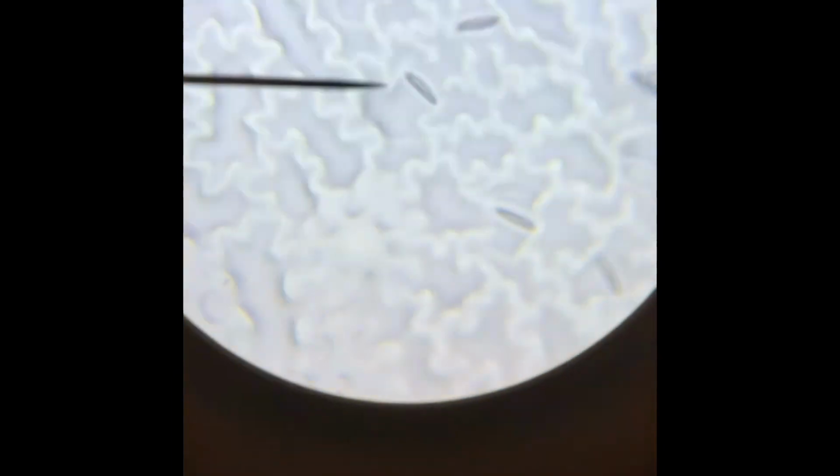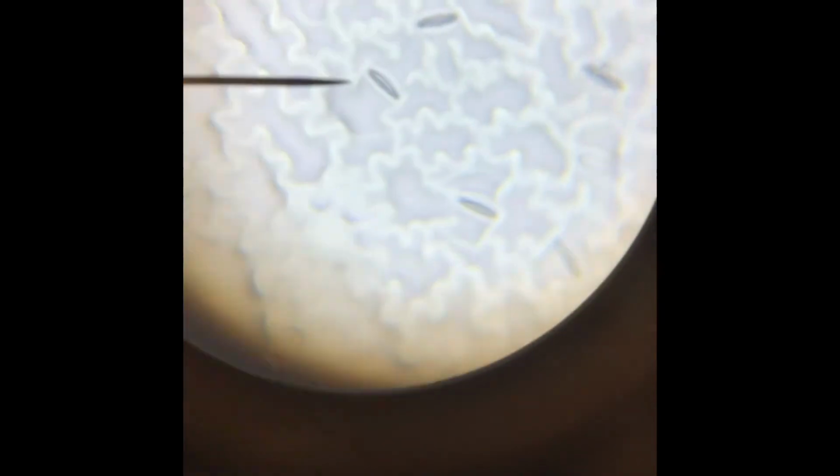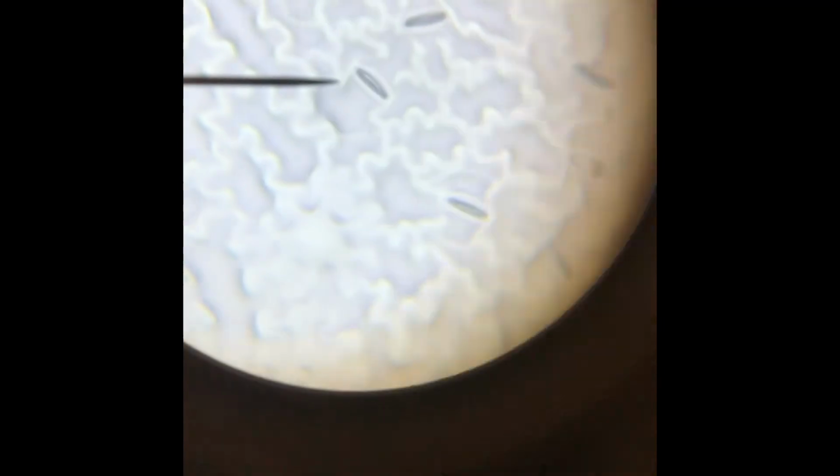Okay, so this is gonna be your first field of view for the rose. You're gonna wanna push pause to this video because I'm doing my best to get it centered. Where you see the pointer, that black line to the left is pointing at one stomata. So if you push pause, you should be able to count all the stomata. Let me see if I can get it one more time. This is extremely difficult to do. Hang on one sec. Okay, there you go. So push pause. Hang on. There you go. Push pause and count.